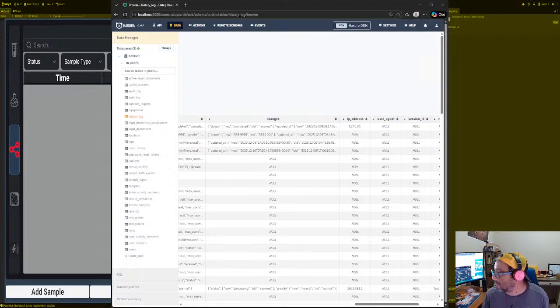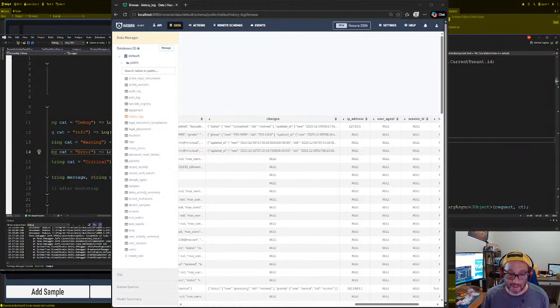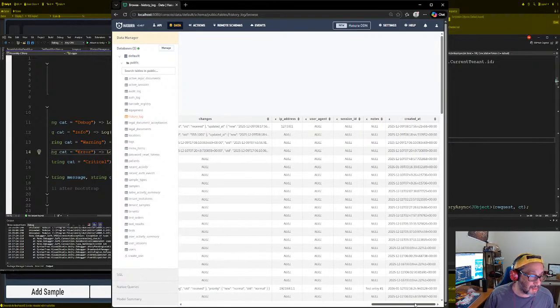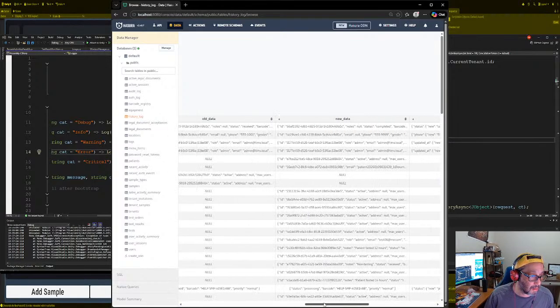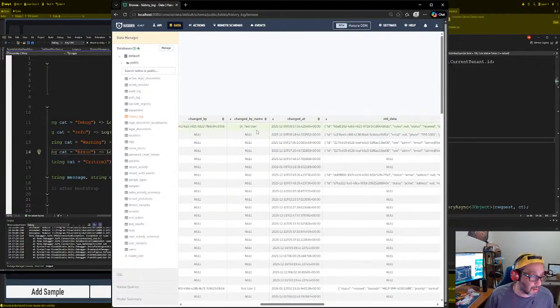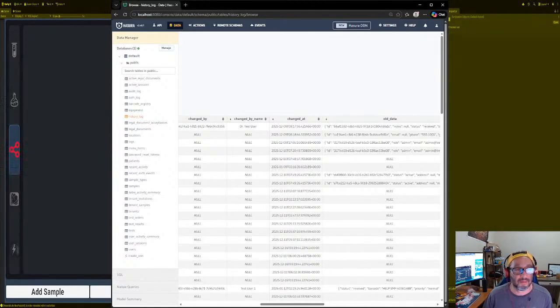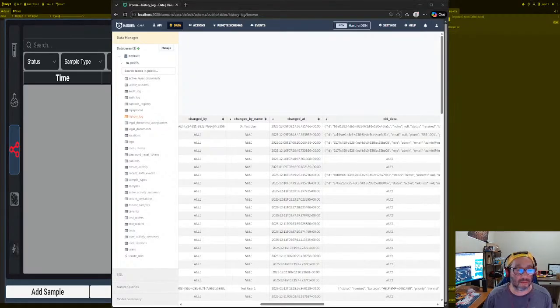Change by name. Yes, we do have a change by name. I must have misspelled it. Changed. Oh, changed. I'm an idiot. Sorry about that, folks. One more time.